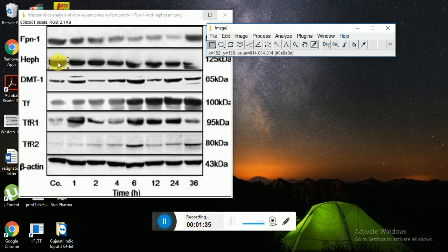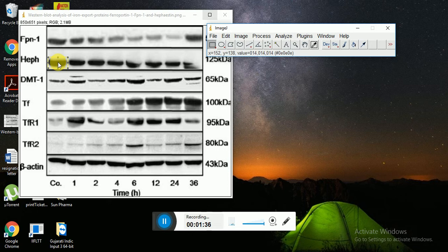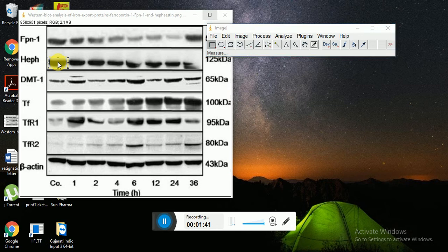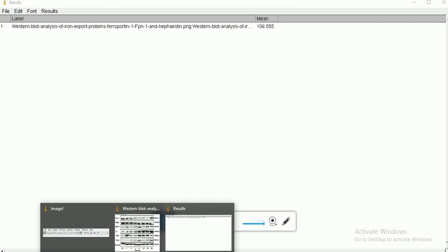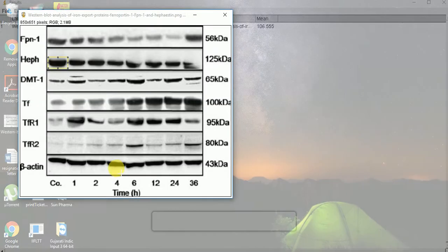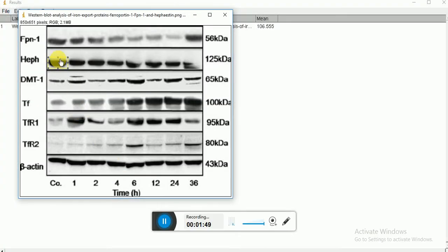Now I will press Ctrl M so I will get data of mean value, mean gray value of this. Now just move these to another blot.